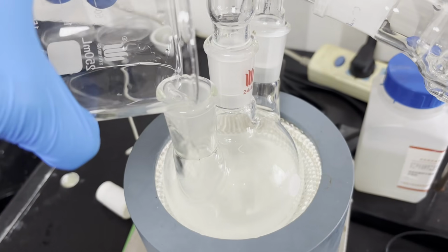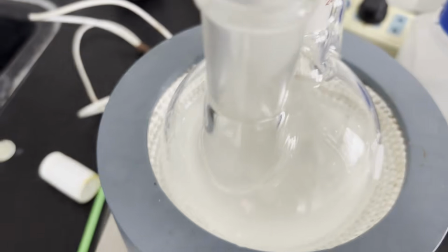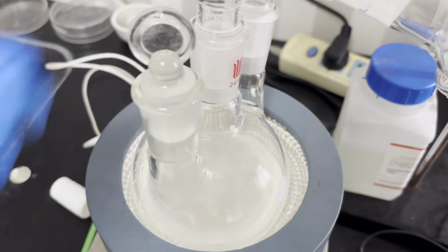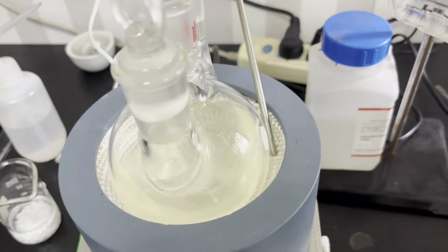The mixture is then heated gently until the thermometer reads 57 degrees C and large amounts of acetone pour into the condenser. I found it necessary to set the heating manual temperature to 100 degrees C in order to maintain a fast distillation rate. Note that the cooling water reservoir has several ice bags placed in it, as cold water is best used because of acetone's low boiling point.